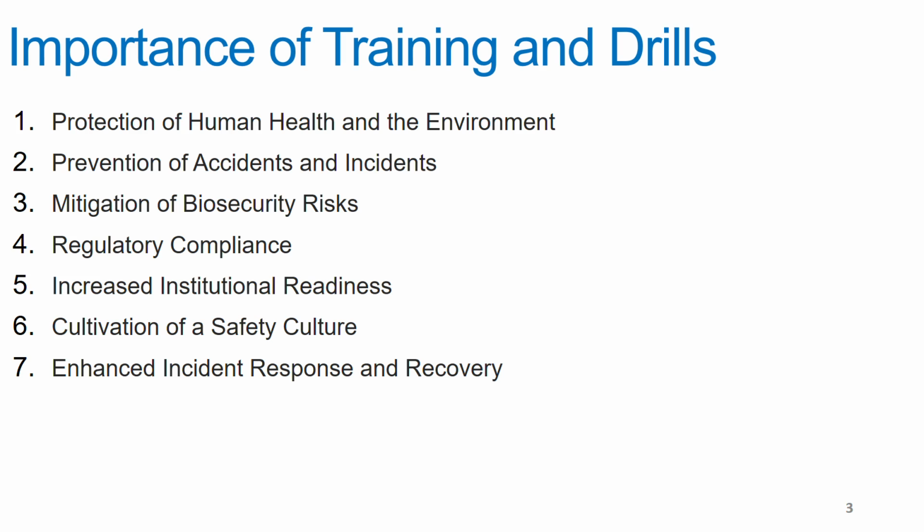Increased institutional readiness. Mostly this will apply to the drills. If you're doing periodic drills, you'll be checking how ready the laboratory staff are to respond, how quickly they can respond to these incidents.